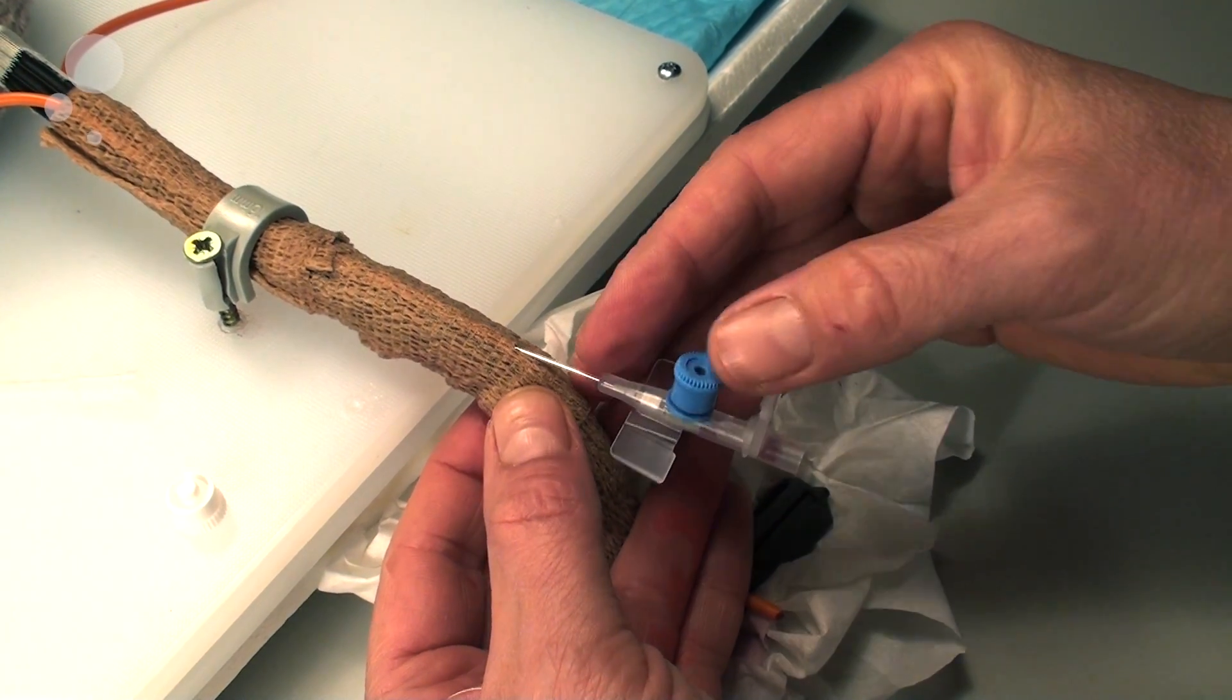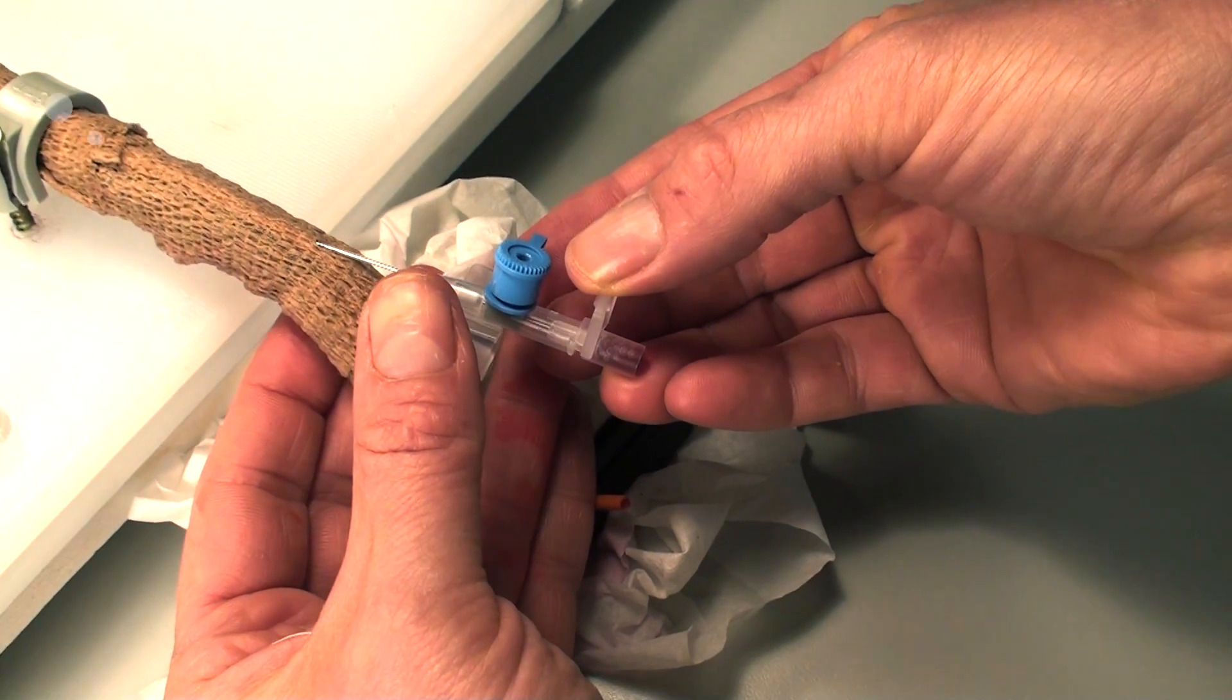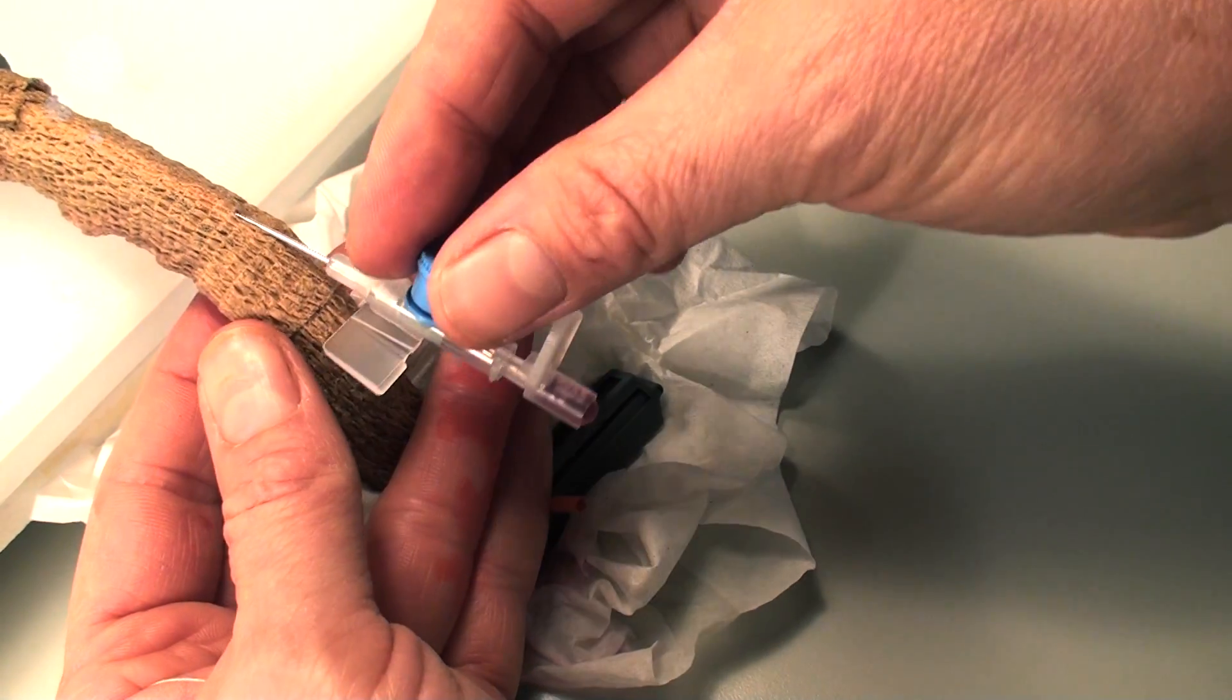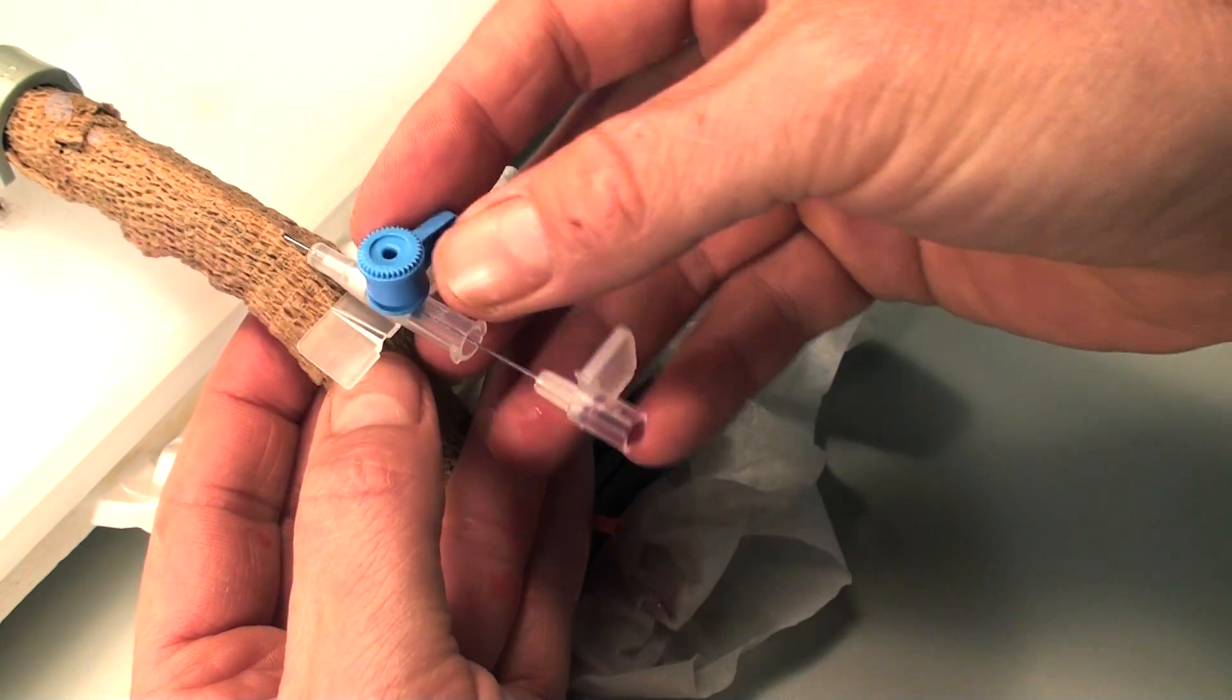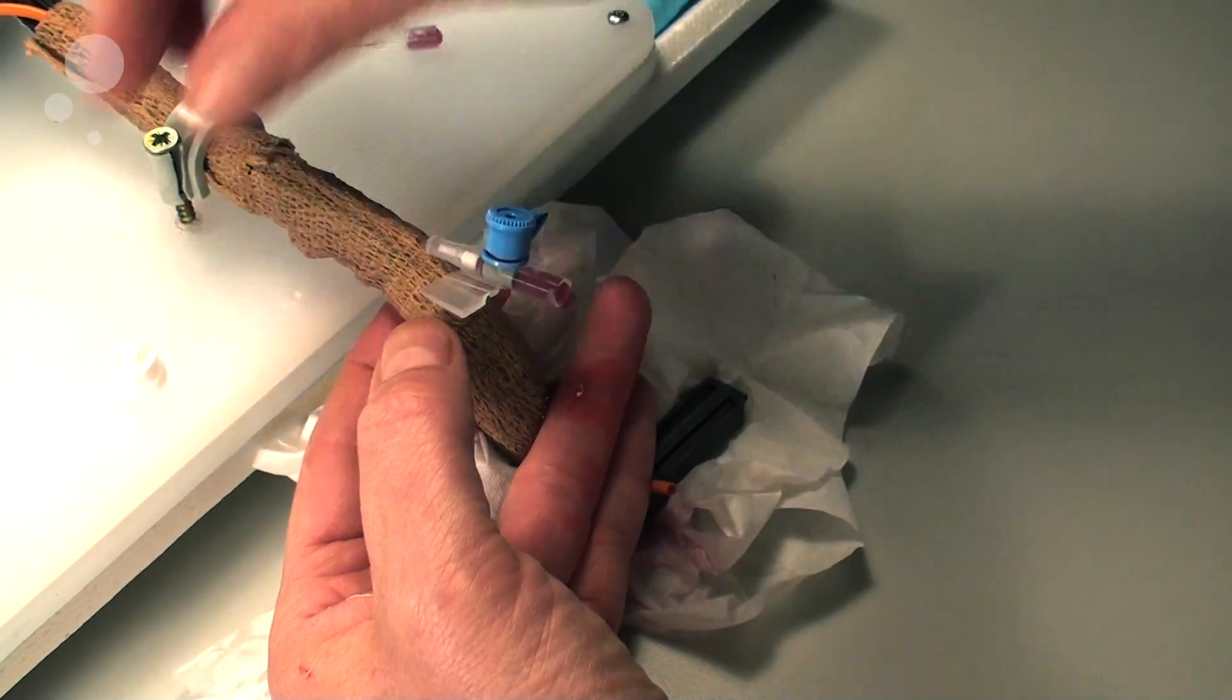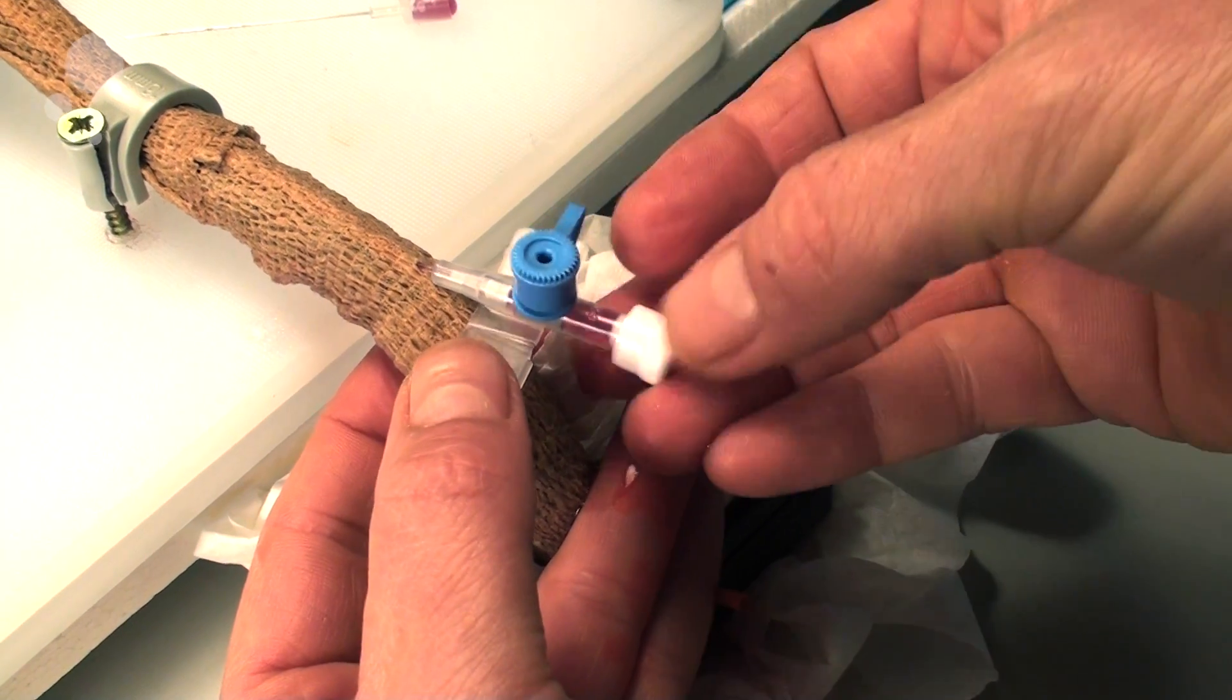When the blood starts flowing in the catheter here, you will take back the tip of the catheter needle. Introduce the catheter slightly a little more and a little more. Then you will remove the needle entirely and put on the stopper to prevent the blood from spilling out of the catheter.